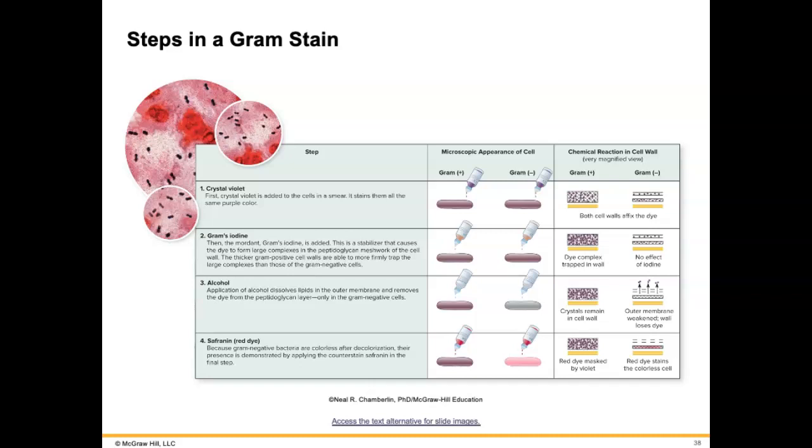So it speeds up the ability for the doctor to treat a patient by doing a gram stain. And a gram stain is a very quick test. Basically, if it's a wound culture, they culture it, or if it's sputum, or if it's urine, or stool, although I don't think they would do this on a stool culture, but pretty much most cultures that come down, we can do a gram stain on it fairly quickly. We're talking minutes. It takes 5 minutes, 10 minutes, 10-minute turnaround time tops.